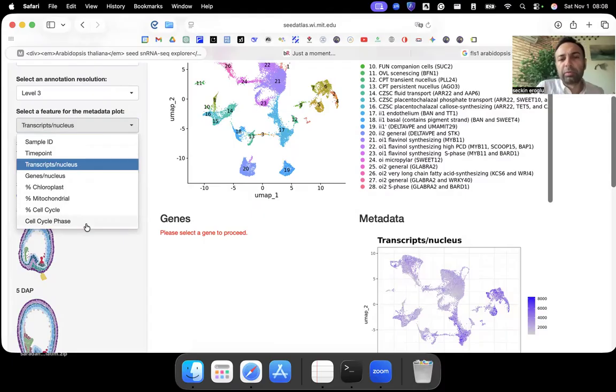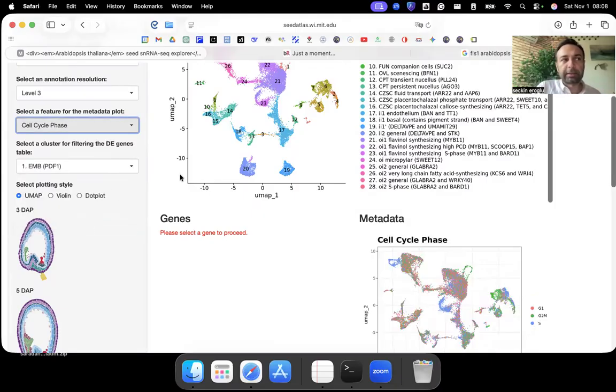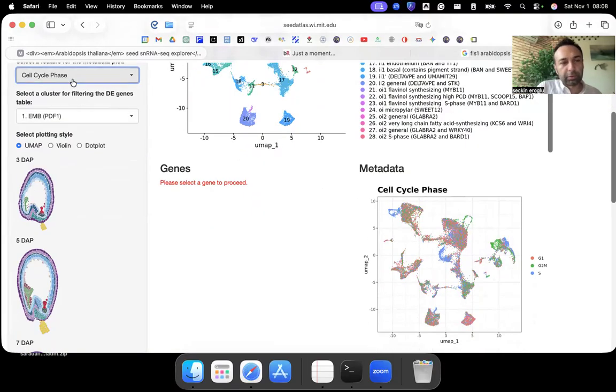Here is another feature which is, I think, less important. For example, which stage, so these are actively dividing cells, all of them. Which stage are they in, like, are they in S stage, M stage, G stage, and so on? If you do this, then it examines all the metadata and gives you this. So most of the cells, when the experiment was done, were in G1 phase.